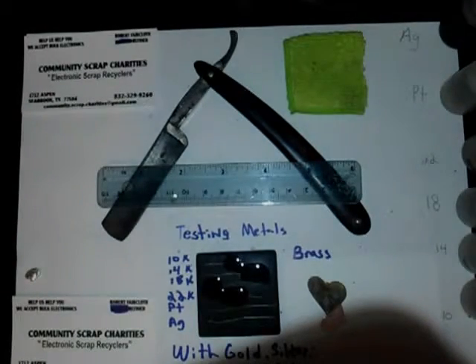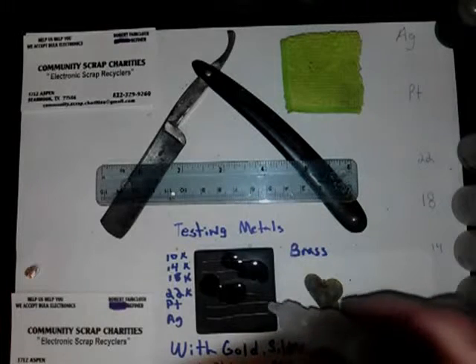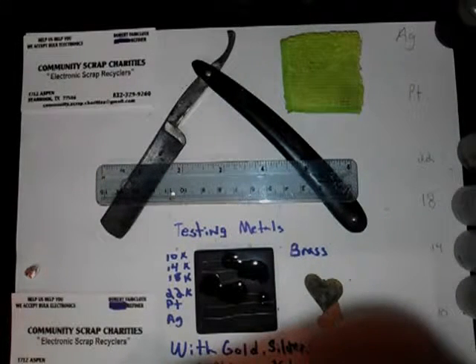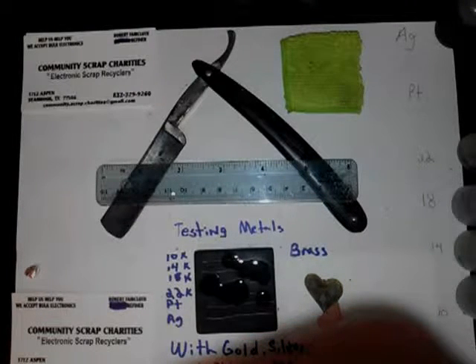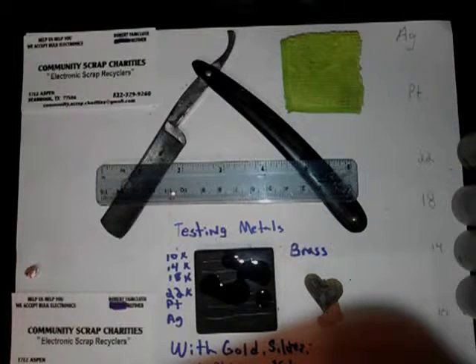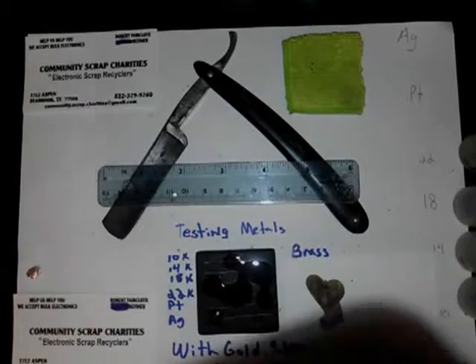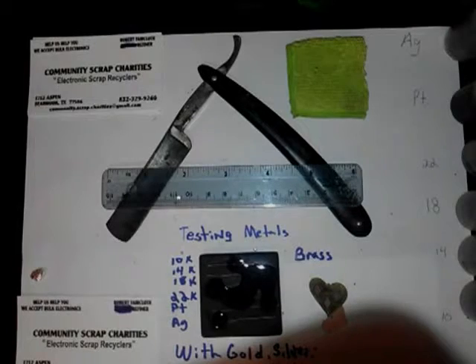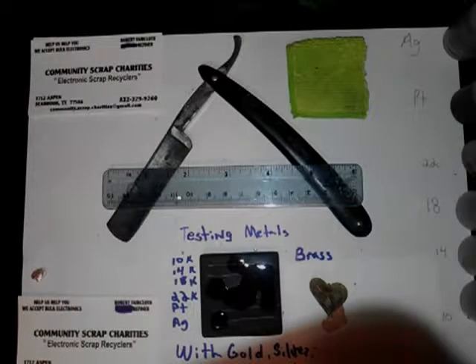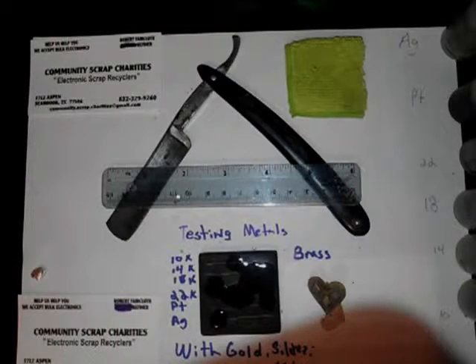It eats it away though, but it doesn't — seems like the higher we go here, we'll see. Here's the platinum solution. Nothing for platinum. Not much for platinum. You can probably see that. And here is silver solution — this is testing for silver or not. It doesn't look like silver does much either.